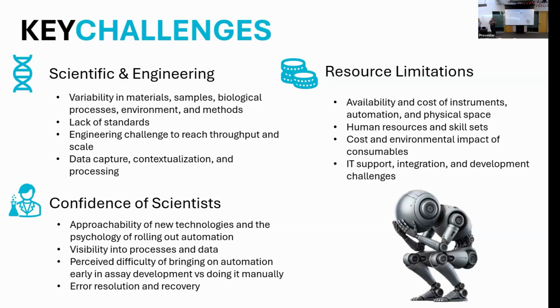And so that leads to resource limitations, right? How do you afford the cost of the instruments? What's the ROI on that investment? And how do you ensure that your team has the right skill set that they can really manage the automation that you bring into your lab? Again, it's a much bigger problem than just finding the right technology to solve the problem. You have to understand the context in which it's going to be applied.